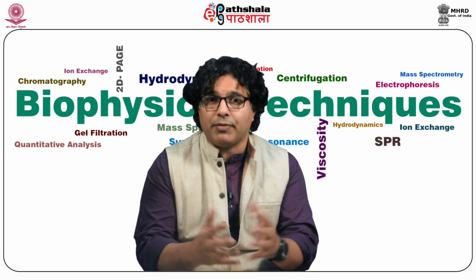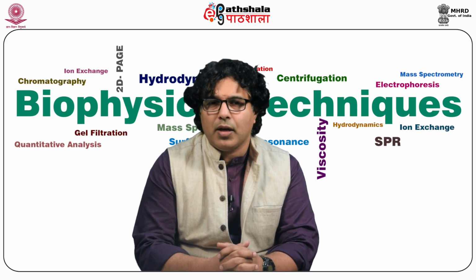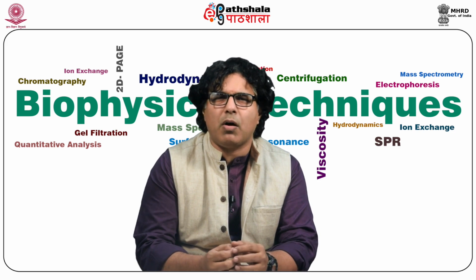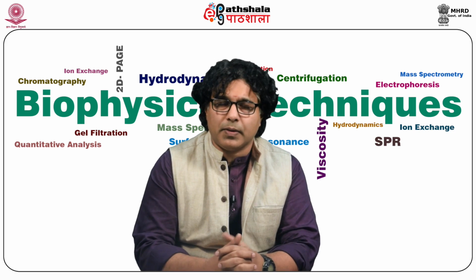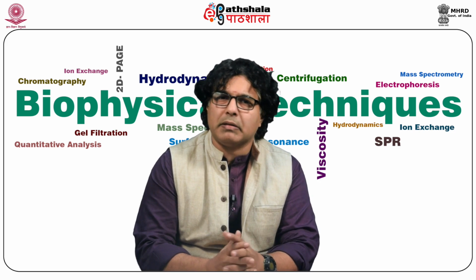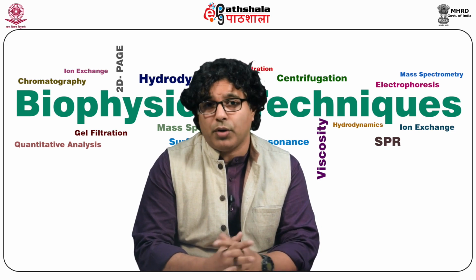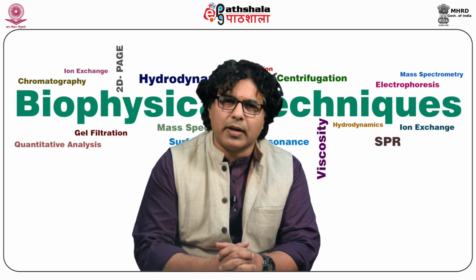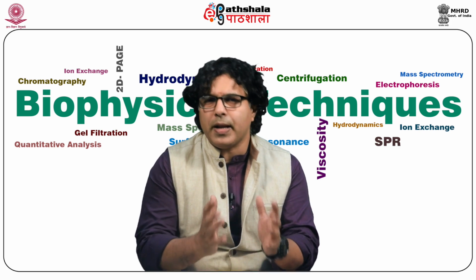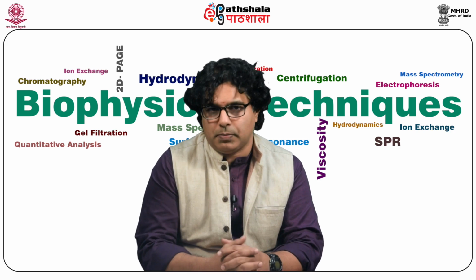Otherwise, if it doesn't have any conjugated double bonds, or the required molar extinction coefficient, you will not get good sensitivity. For 1 microgram you may not get any peak at all. Or when you keep on increasing, you might get a peak somewhere around 20 or 40 micrograms, which is of no use if your analyte concentration is 100 nanograms. Therefore, a concentration step is employed here. You have to work with logic to make this possible.